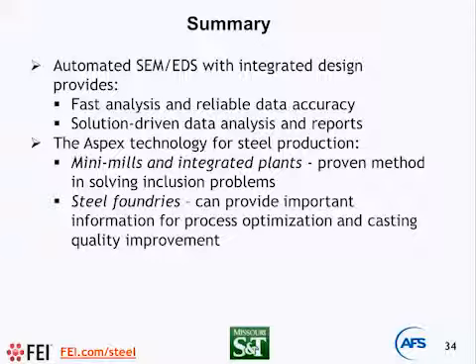Yes, I will say we need both methods, because in the foundry business we also need to see the structure. Without an optical microscope we cannot see the general microstructure. So I believe we need both tools, the scanning electron microscope with automatic feature analysis and the old-fashioned optical microscope, and they can be very helpful when they work together.